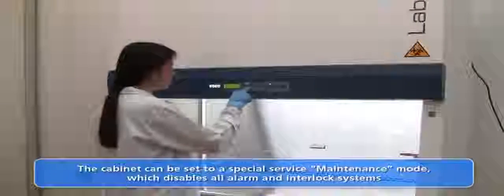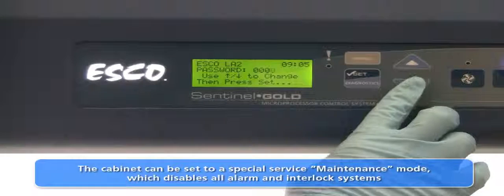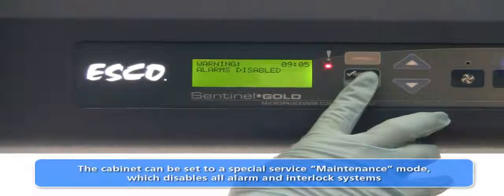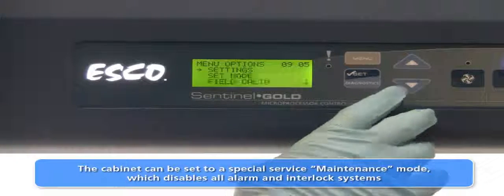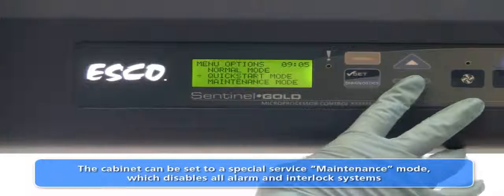For service personnel who require the cabinet alarms and interlocks to be deactivated for maintenance purposes, the cabinet control system can be set to a special maintenance mode. Protected by an administrator password, this feature is designed for use by service personnel during cabinet decontamination and other service procedures.